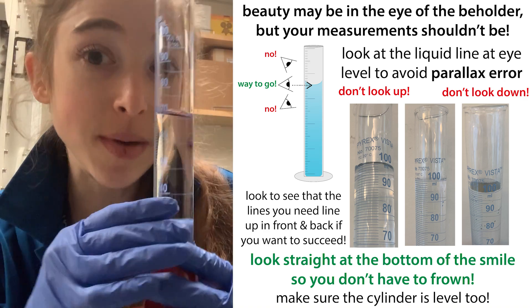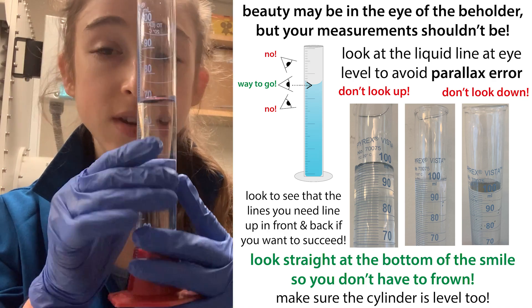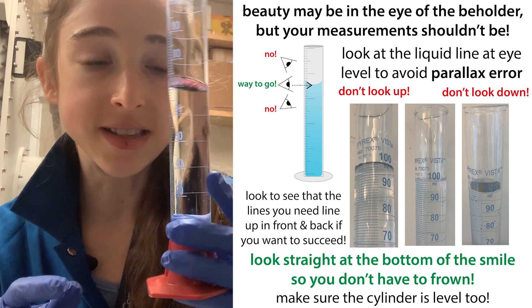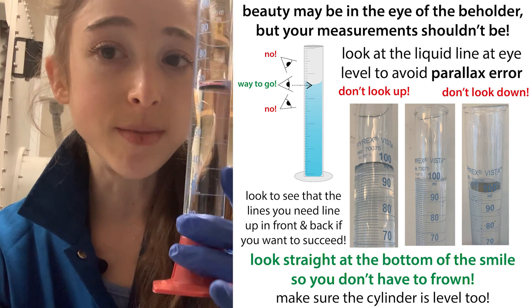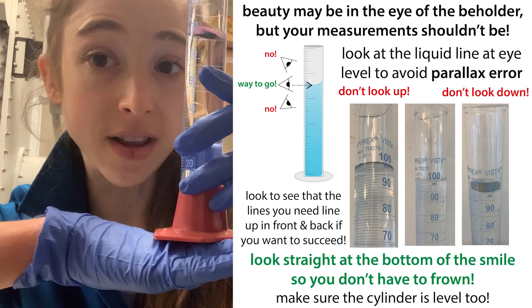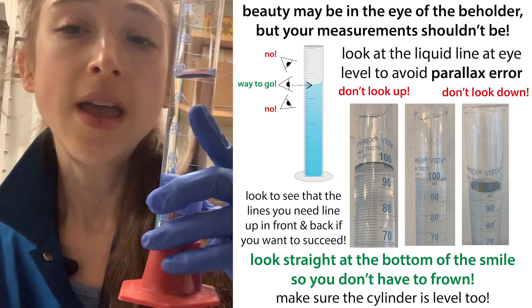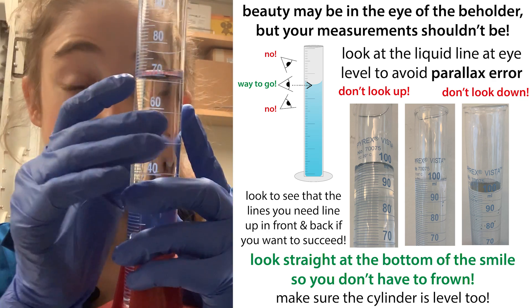You can avoid parallax error by keeping eye level. You want to make sure that your eyes are level with the thing and that the thing is level. Right now you can see as I'm moving this all around, it looks like the level is changing. So you want to make sure when you're doing the measurement that it's on a flat surface, and you might have to bend down or get on a stool. If you have to hold it up, you want to make sure that it's still level.